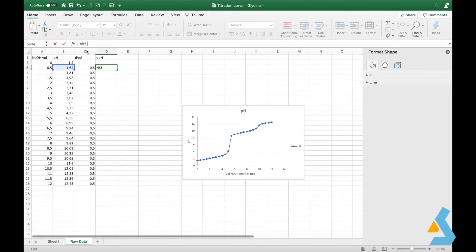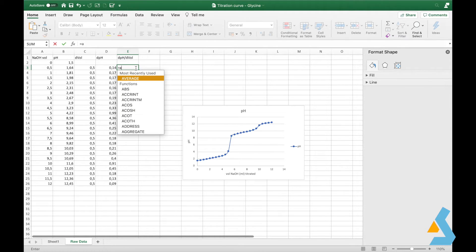The second column shows the change in pH after each addition. For this, we take the difference between pH and click the right bottom of the cell to fill out remaining cells. Finally, the third column shows the change in pH with respect to change in volume titrated, thus the derivative. In this last one, we take the absolute value of this ratio to make the curves positive for easy visualization.